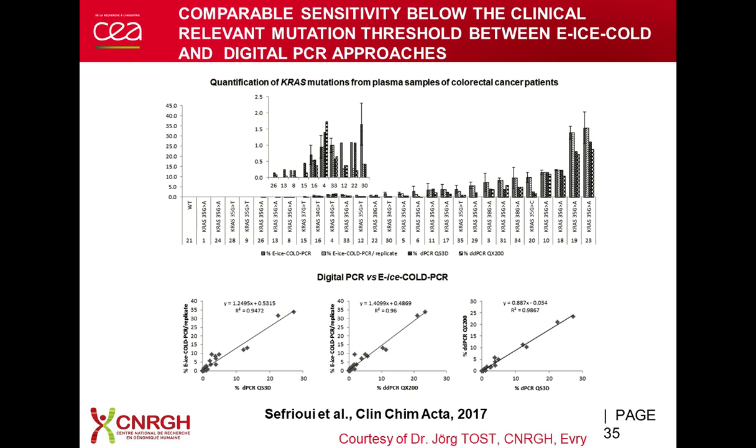And again, this is a slide that we received from Jörg Tost's group in France, who has done detailed such studies. They have compared that to digital PCR. So they took individual mutations and they compared the quantification that they get with ice cold PCR as compared to digital PCR. And as you see at the bottom in the 3 graphs that are presented here, you have nice straight lines in all cases.